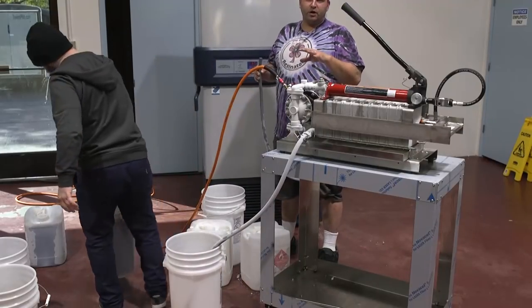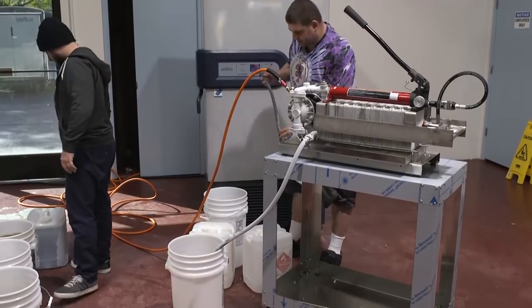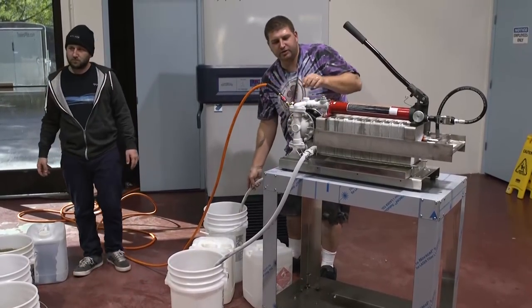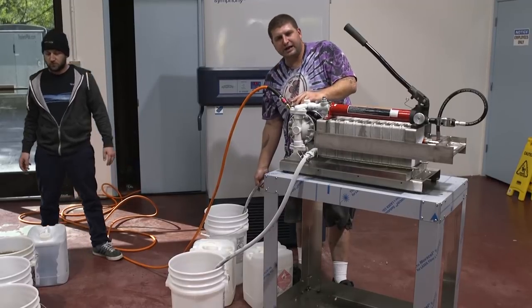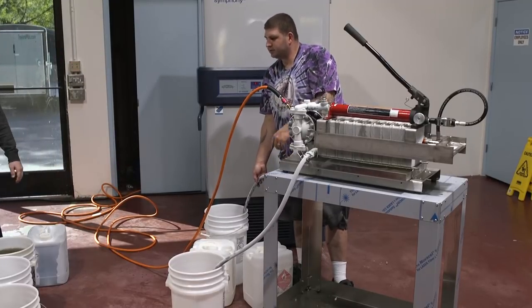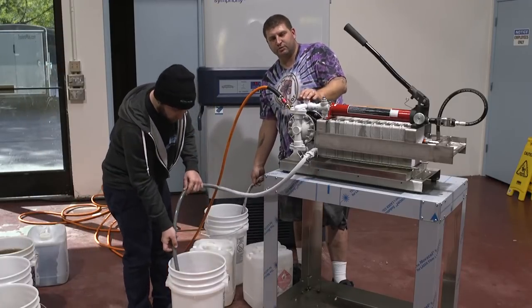Now we have to flush all the oil out of the system so you just retain your white fatty waxes. We go back into the original cold alcohol and push it out until the liquid goes clear. We're going to watch the liquid go clear and that's going to tell us when we're done.